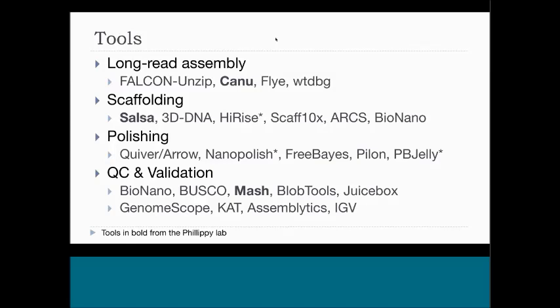And so simply opening up the assembly in IGV and looking at depth of coverage goes a long way towards that. There are some statistically based measures of assembly quality based on k-mers and mapped reads that apply a Bayesian type test to measure how well the assembly represents the input data. But those currently only give you global scale metrics of the assembly. And if you're looking for local metrics, mapped read coverage is still probably my favorite approach.